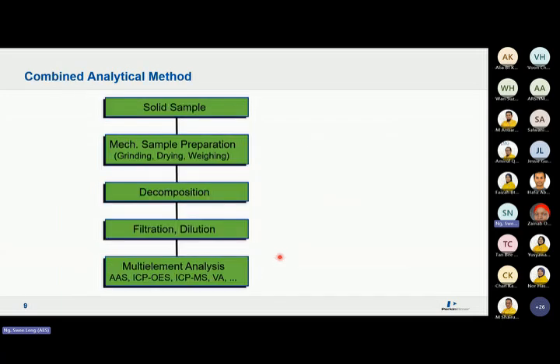That's why microwave digestion is similar to a fusion bead, but the fusion bead process is a bit longer. So now we combine: we still need sample prep, but you use the microwave to digest. You decompose using the microwave, and this becomes a solution that is harmonized. Everybody has an equal background. Then you can run them on the same external calibration curve, or else calcite and other types of rock are not the same material.